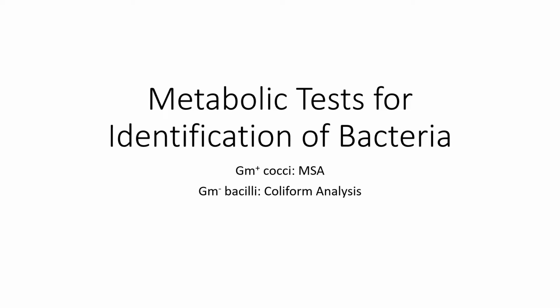Hi, so now this is the second half of the metabolic test for identification of bacteria. We'll finish up the gram-positive cocci tests. That's the mannitol salt agar. And then we will begin the gram-negative bacilli tests. We're only doing 2 of those, and the first one is the coliform analysis.